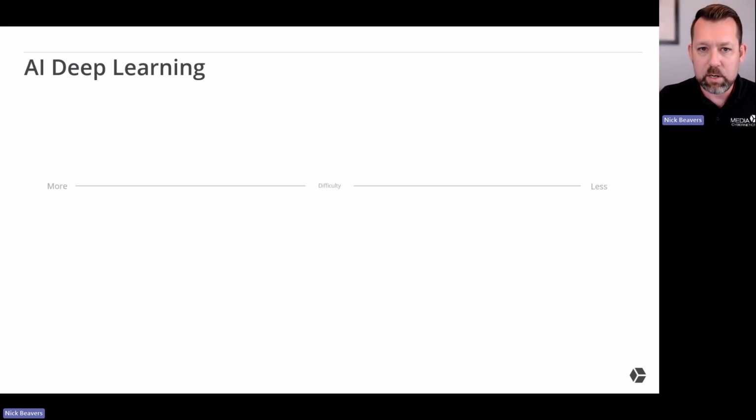When it comes to AI deep learning and creating your segmentation outlines, whether that's large areas or a particular type of material or objects, there is a scale of difficulty. And if you're really familiar with AI, you'll know what I'm talking about here. And if not, be prepared that when you do enter the world of AI deep learning, you're going to come across these very quickly. The first one, the most challenging and time consuming, is starting with training. That means it has no knowledge of where your images came from, what they are, and what ground truth is. And so starting from scratch takes a long time.